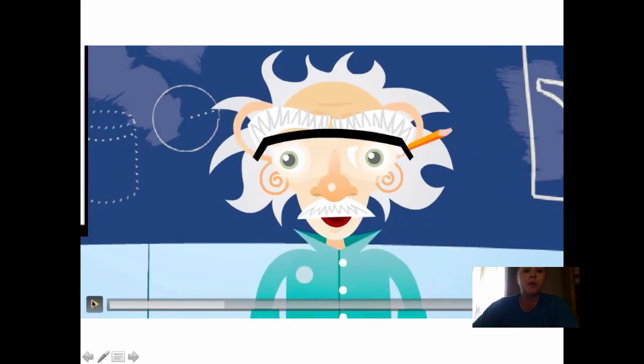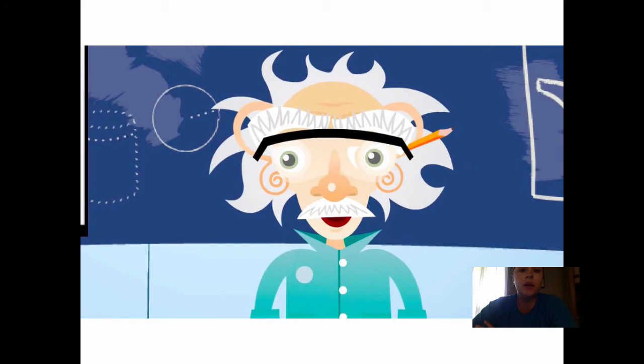In your eyes. Okay, so just so we can have some practice, they gave two rules during that first part. The first one was to not tinker in the lab when there's no teacher around, which means basically if you come into the classroom and you see equipment laying out, don't touch it until the teacher gives you permission. That way you'll know exactly what to do with it. And the second one was to wear goggles.